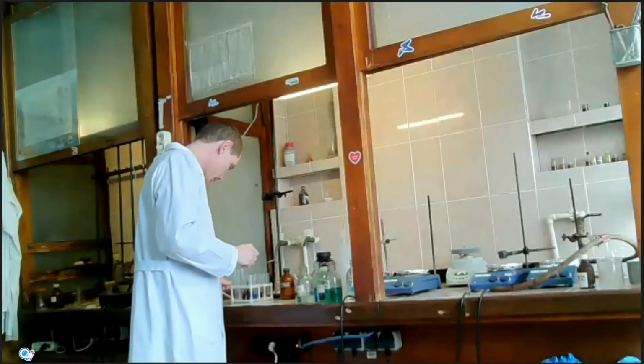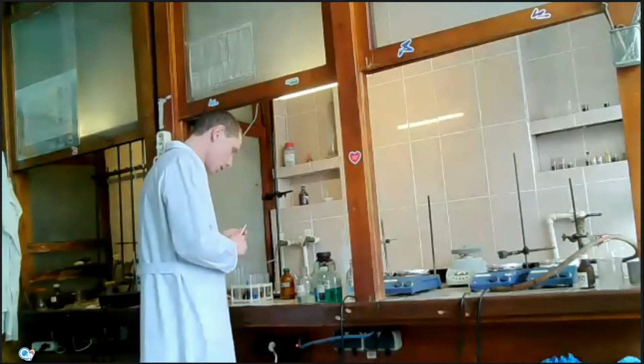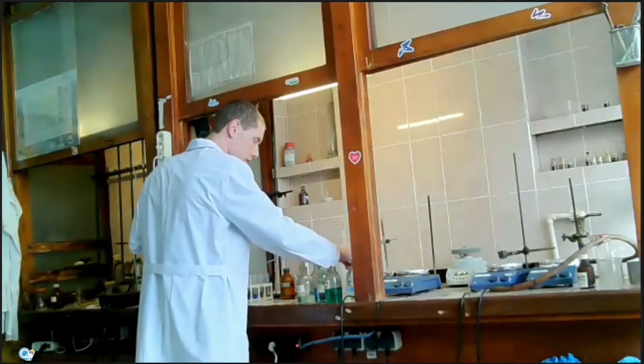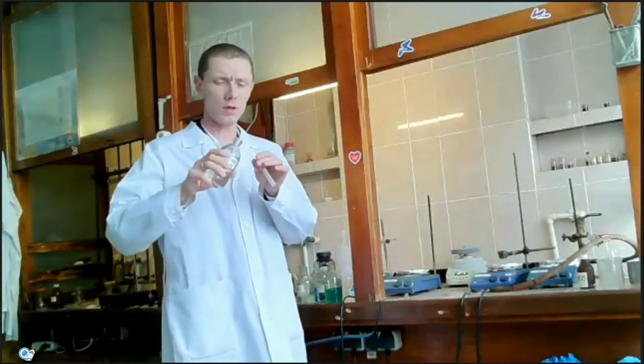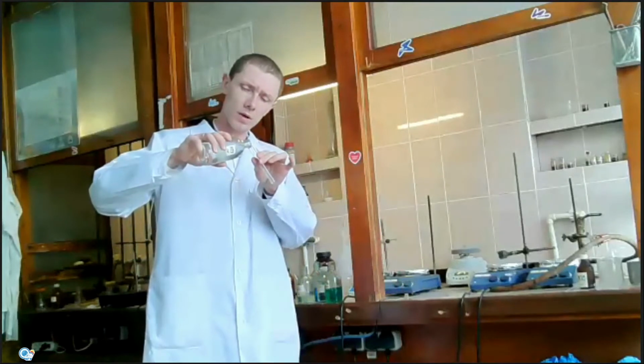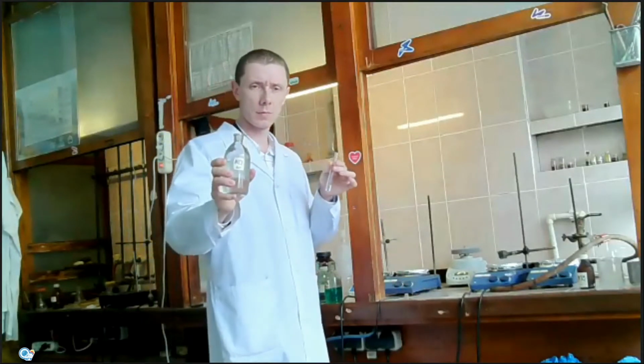Next experiment. I think you know that particularly all potassium salts are soluble in water. For example, I take potassium chloride.